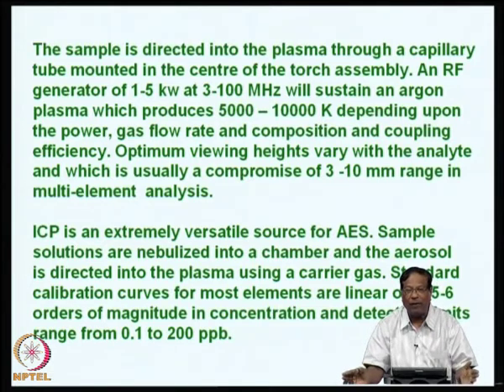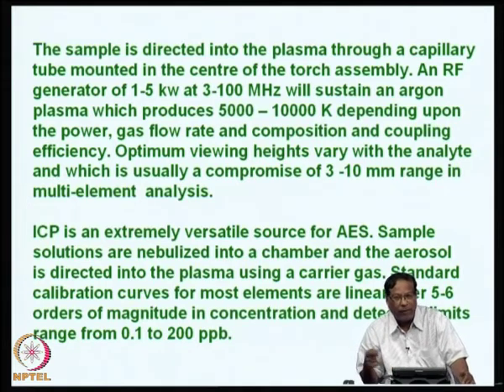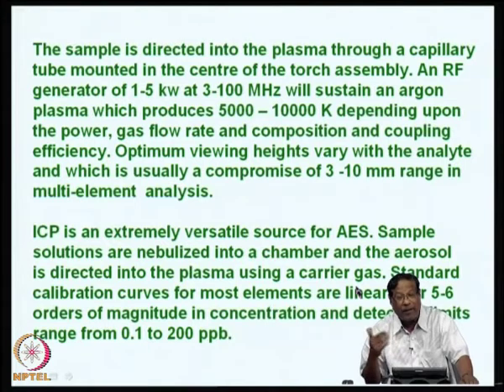Nowadays instruments are available which are benchtop models. That means, you can just put it on a small table and introduce the sample and continue the analysis. Benchtop models are available. They are not very big and sample solutions are nebulized into the chamber and the aerosol is directed into the plasma using the carrier gas itself, that is argon.